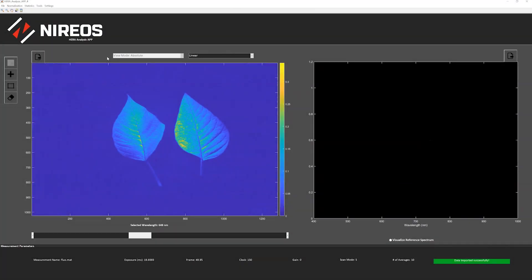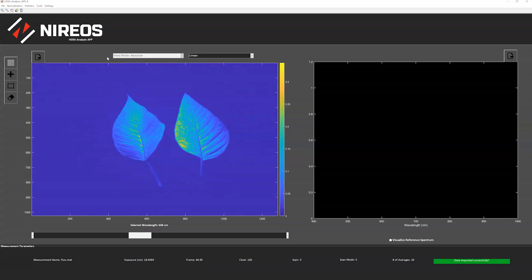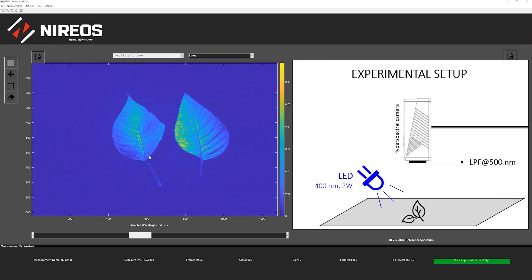I grabbed the opportunity to show you another image that I have already acquired. This is a hyperspectral image not of a reflectance signal, but of a fluorescence signal. These leaves were excited and illuminated with a blue LED at 400 nanometers.